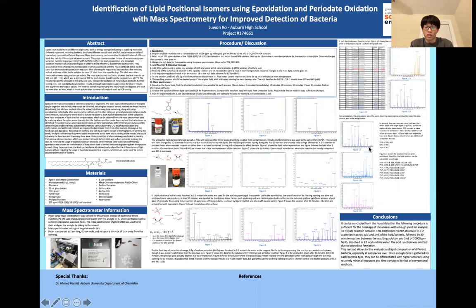And as we can see, the lipid isomers were effectively distinguished, whether this is clean or whether we can actually evaluate the identity of the lipid position isomers or not. But anyways, by using this, it would be possible for even subspecies-level detection to be possible.